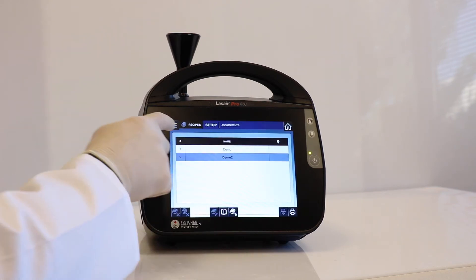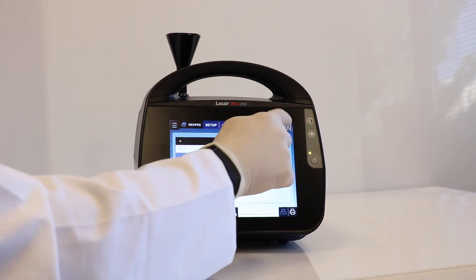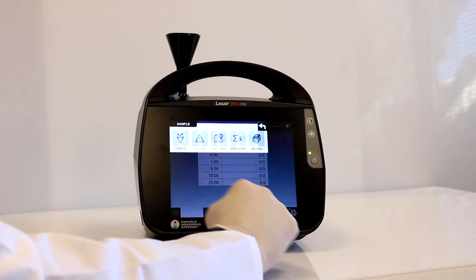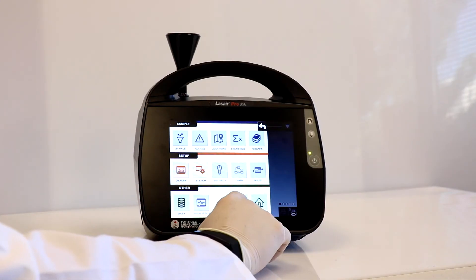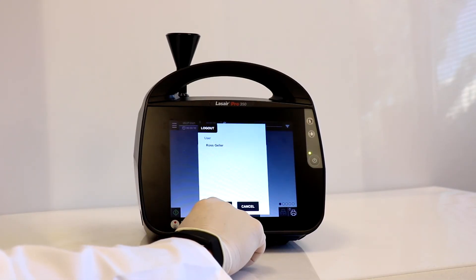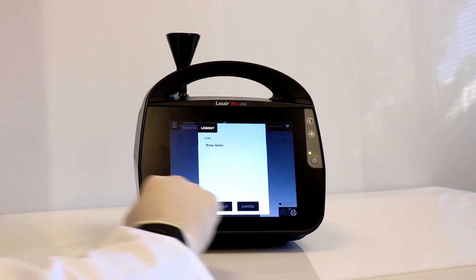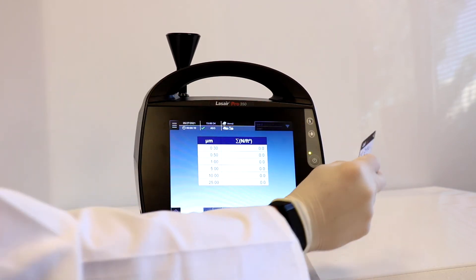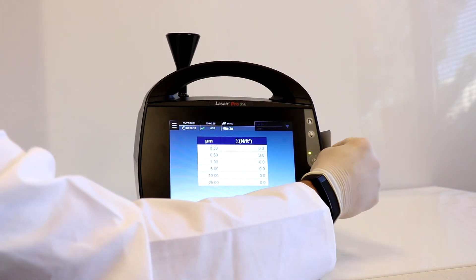Now, we will log the current user out by navigating to the menu screen and selecting the logout icon. Now that this user has been logged out, we can log in a new user by NFC card.